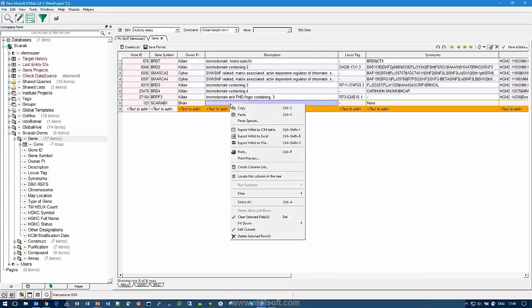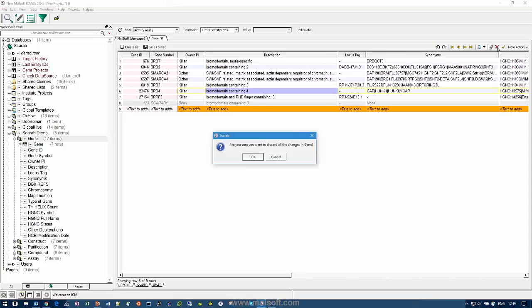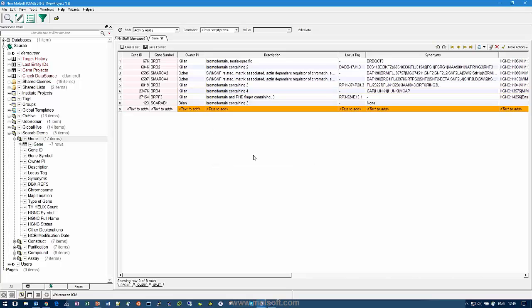Now, I need to delete this data now because it's not real. So I click on delete. It's grayed out. It's naturally still in the database until I hit this button. If I decide that I'm about to do something stupid, I can hit the red X. You want to discard the changes, and it will put me back where it was. So that's how that works.